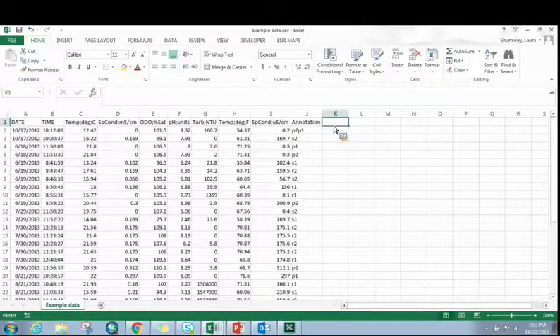All data submitted to WQX Web and WQX needs an activity ID. So what is an activity? An activity is all records or results using the same equipment at the same location at the same time on the same date.